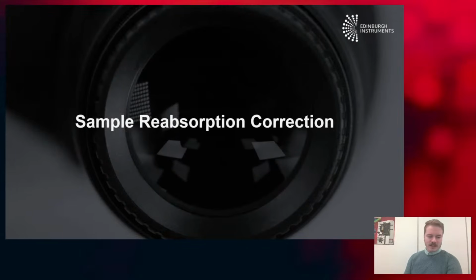Thank you, Tommy. So one of the things that Tommy mentioned during sample preparation of solutions was that we need to get the concentration just right to avoid the inner filter effect. So I'm going to teach you how to correct for what's called sample reabsorption.